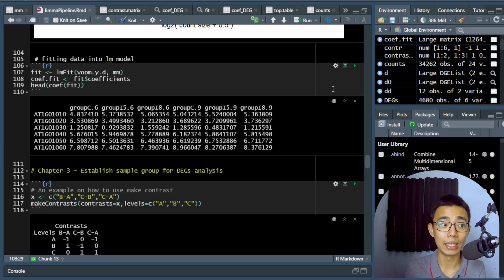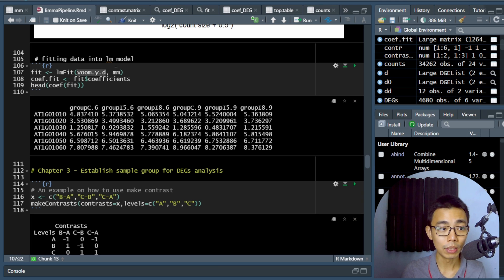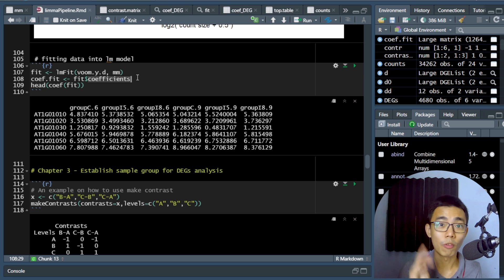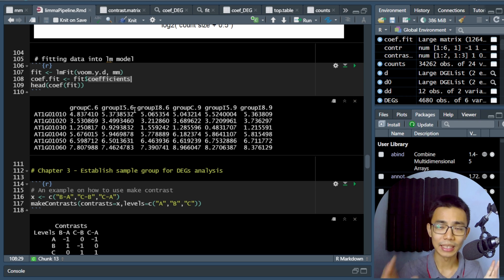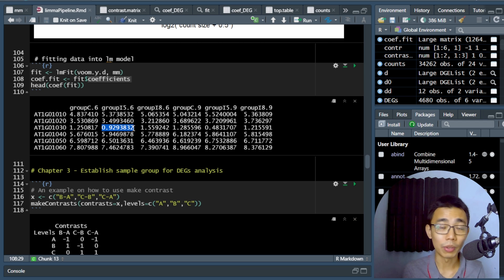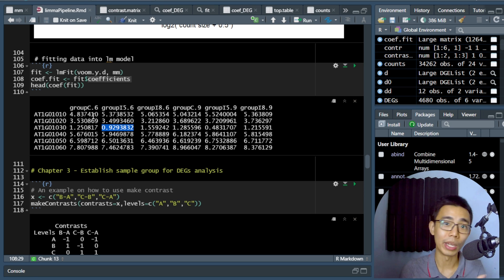Once the voom transformation is done, we fit the data into a linear model using lmFit, including both our voom model and the model matrix. We then examine the coefficients, which represent roughly the average expression across biological replicates per group — log-transformed and corrected with normalization factors. A higher coefficient value means higher expression. Since it's in log scale, a difference of one doesn't mean one extra count — it means a twofold increase.